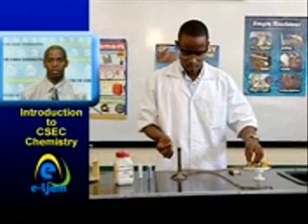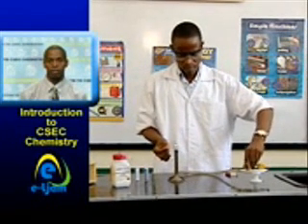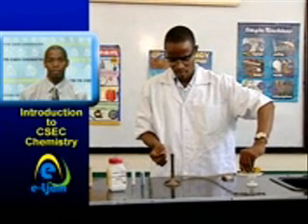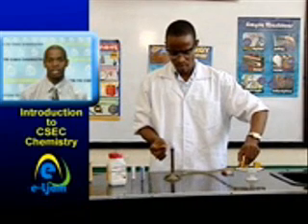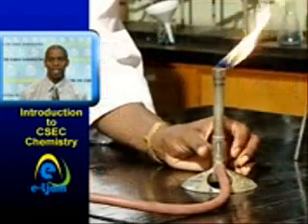Light the Bunsen burner. When you have a flame from the match, turn on the gas tap. Some taps have a safety feature where you must first push down, then turn on the tap to ensure that the taps are not accidentally pushed open. Approach the match to the top of the Bunsen burner and it should light.